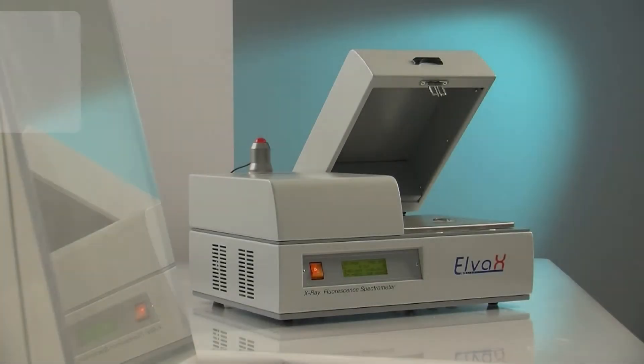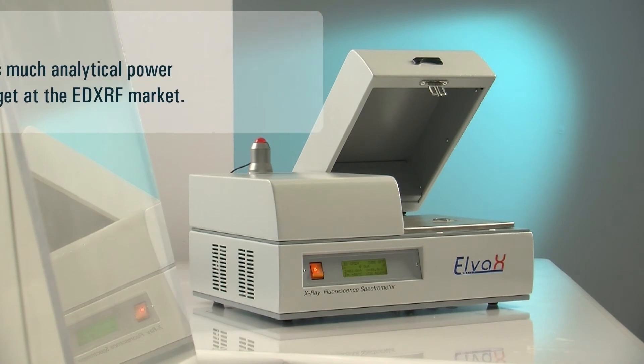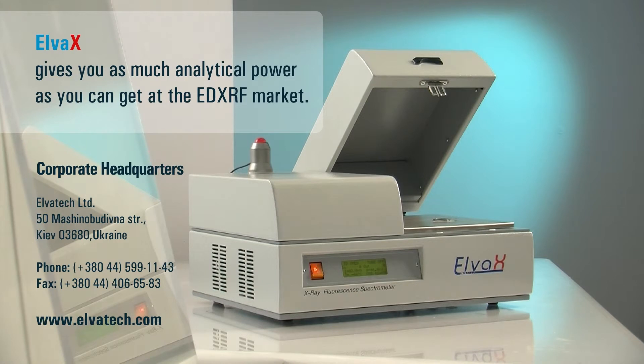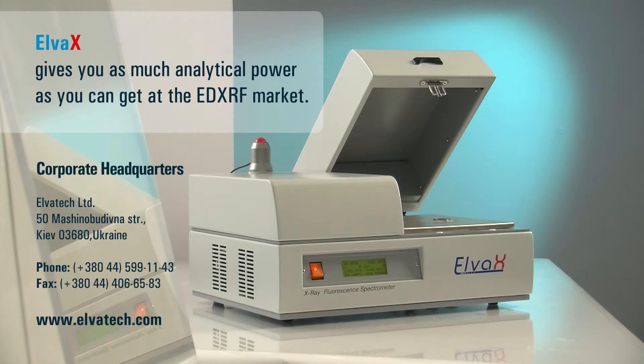Ease and speed of operation, ruggedness, versatility and analytical capabilities make Elvatec a truly comprehensive, cost-efficient solution in EDXRF analysis.